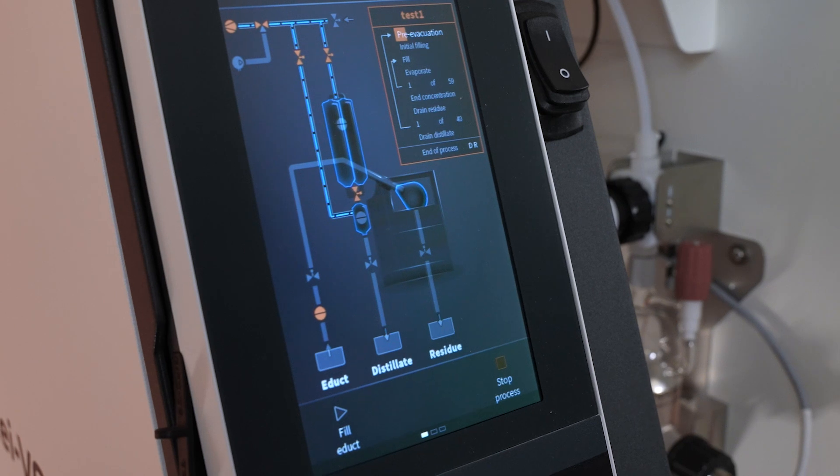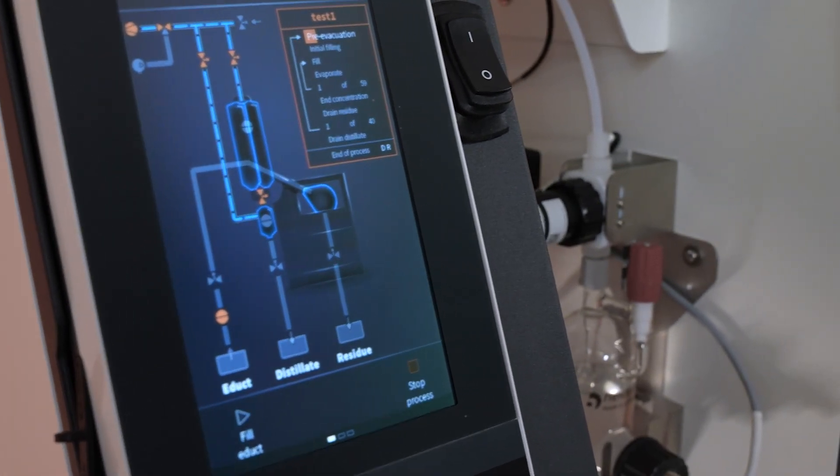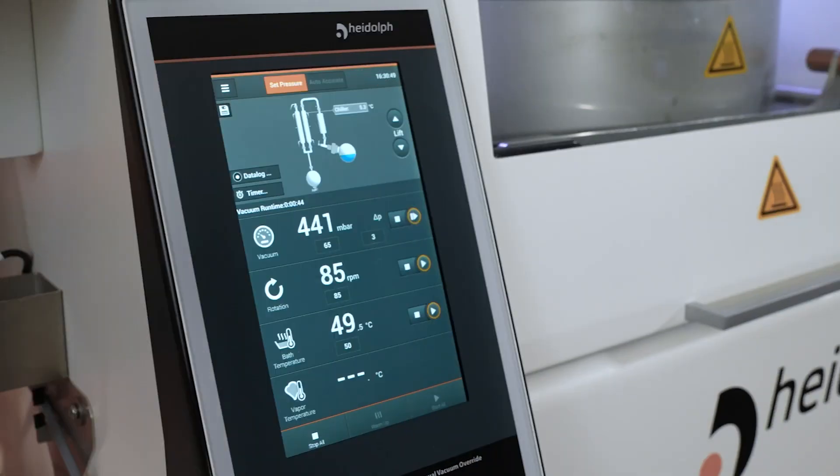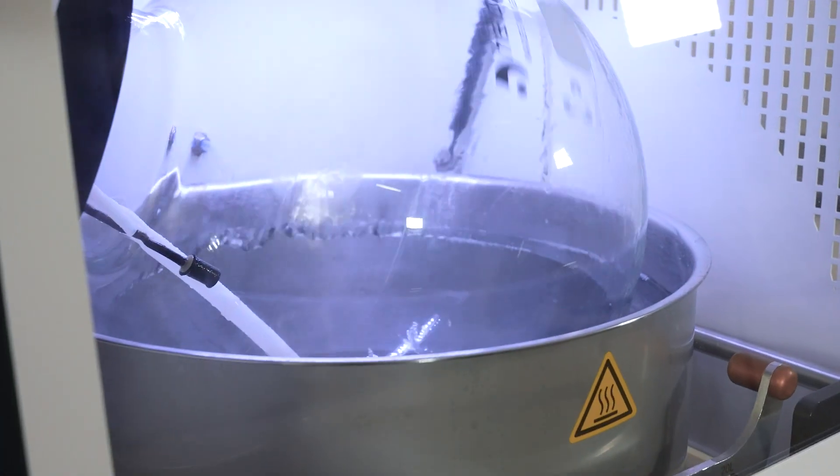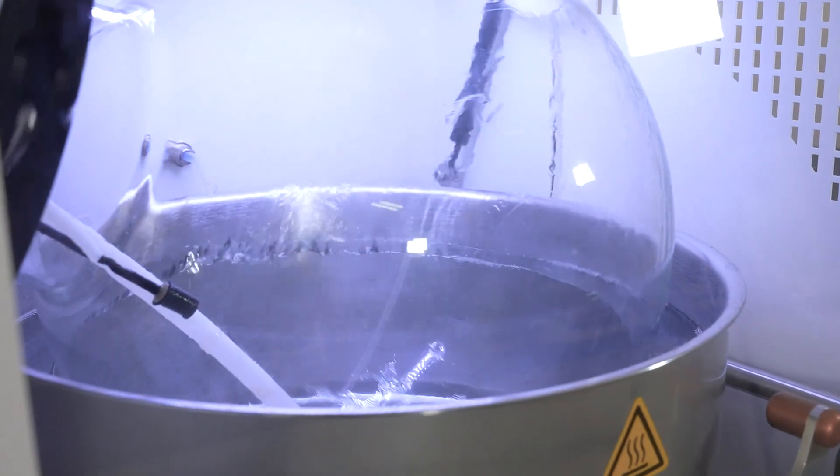The system will also stop the process automatically as soon as the entire mixture is processed. The Distymatic Pro is not only available for bench-top applications but also for large-scale evaporators, allowing evaporation of more volume at the same time. As an example, with this setup you can process up to 1,000 liters of hexane a day.